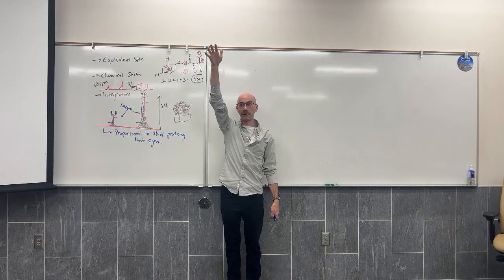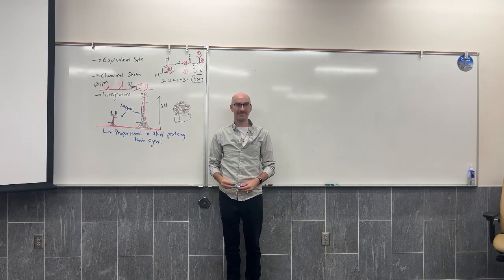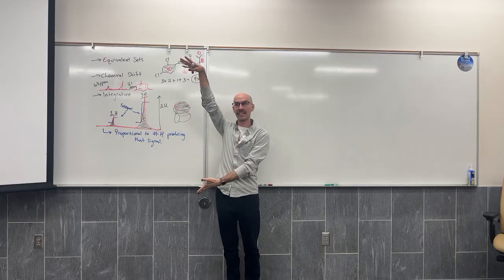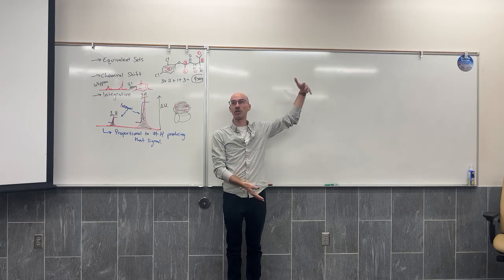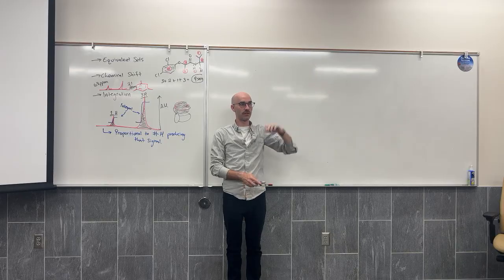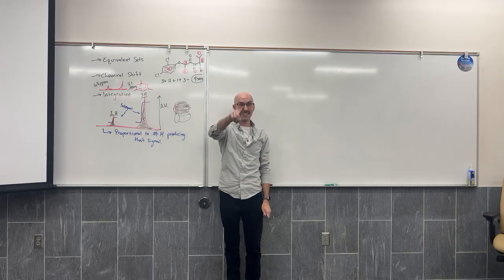Like if I have a choir and I have 5 people singing an A chord, sorry if you're a musician and I'm not making sense. 5 people singing an A, that's going to sound different than having 500 people sing an A. I would be able to tell the difference when there's a difference in amplitude. So the height is nothing.